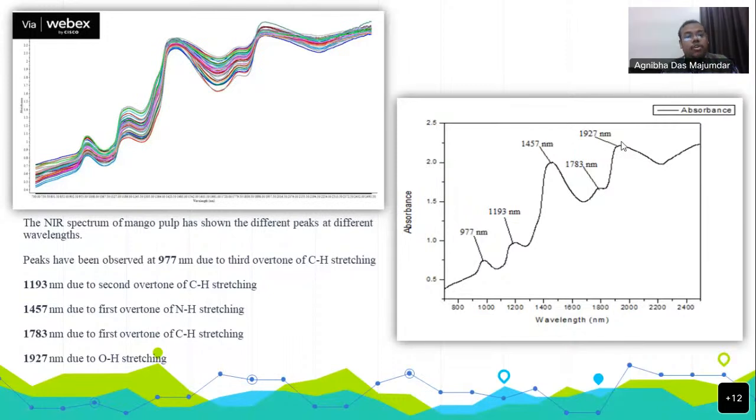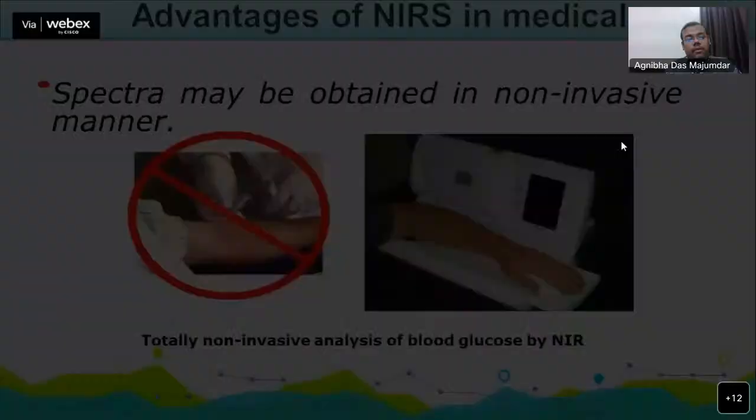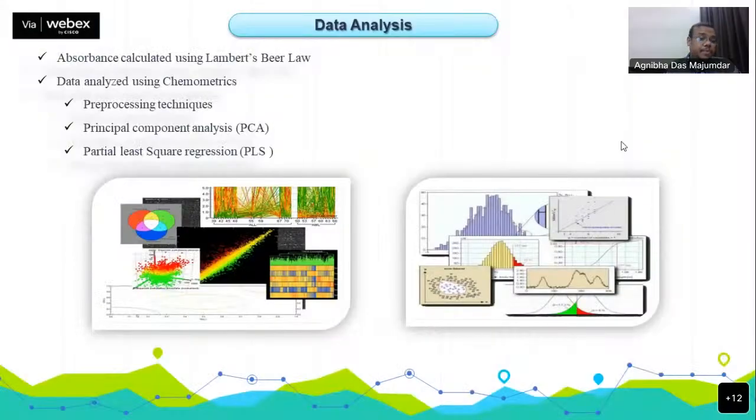So this is raw data, which we have collected directly from the NIR spectrometer. But it has some scattering errors and some noise. So to eliminate those kinds of errors, we will have to use pre-processing techniques in the first step. After applying those pre-processing techniques, we can have an accurate spectra with fewer errors. This pre-processed data is much more useful for the final model development.